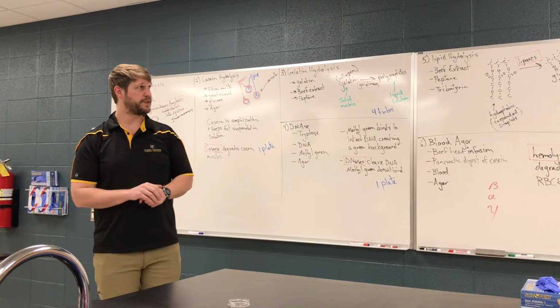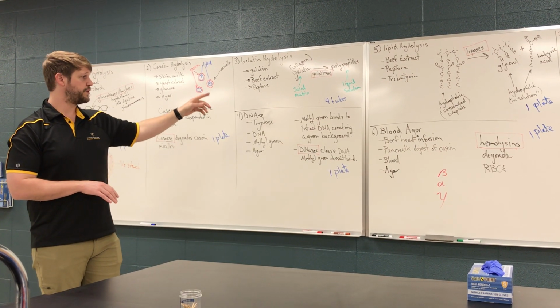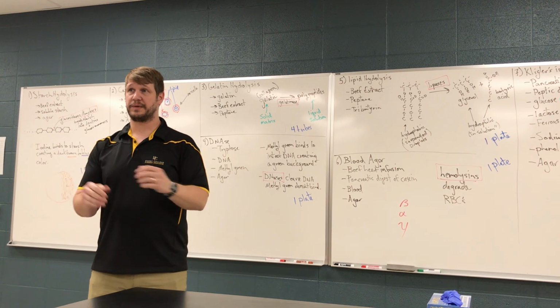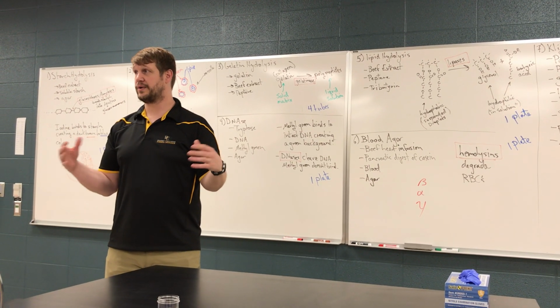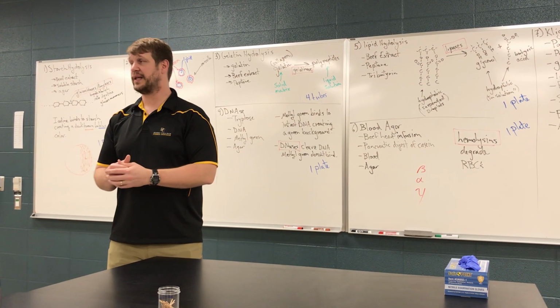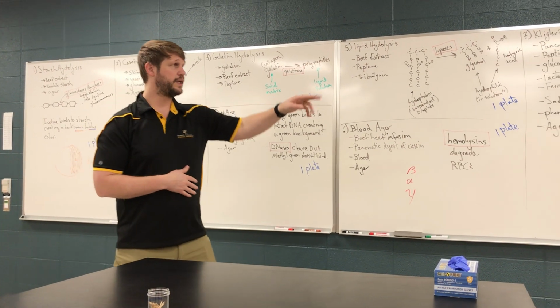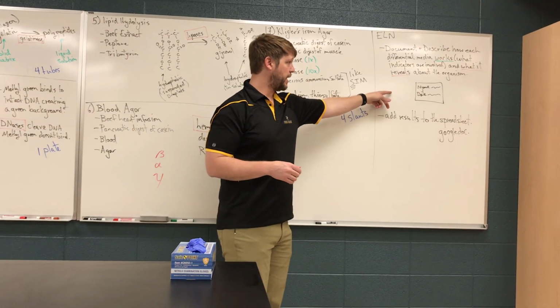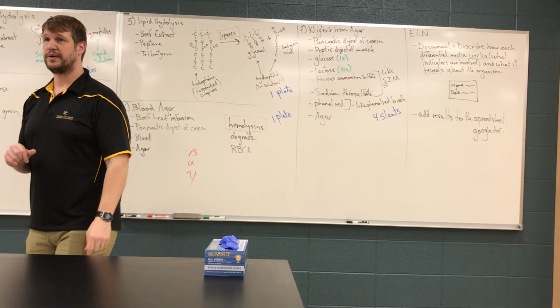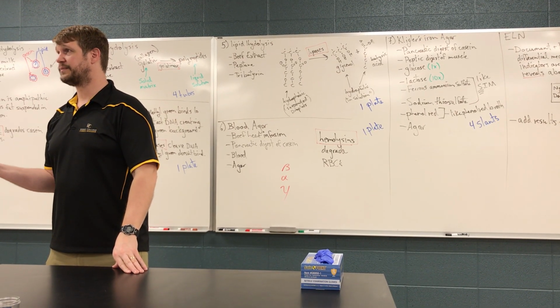All right. Then those are our differential media. So you'll need 4 of those slants, 4 of the tubes, and then 1 plate of everything else. Get those inoculated. This is the last, as I mentioned before too, this is the last week of your knowns unknowns, so you don't have to carry them forward another week. You basically just need to inoculate these new media today and record your results. Again, with the ELN this week, please use a note card with your results, and make sure you add your results to the Google Docs spreadsheet, because after today, we should be able to match up knowns and unknowns.